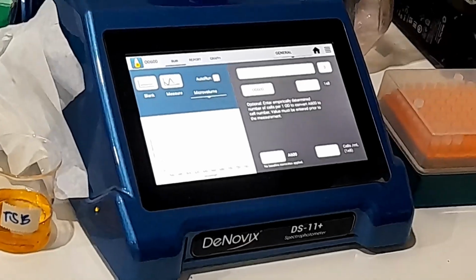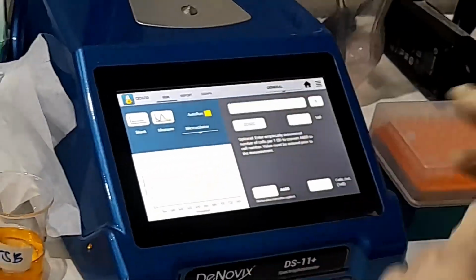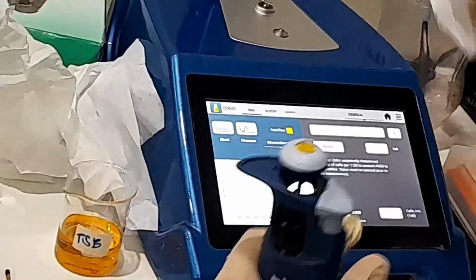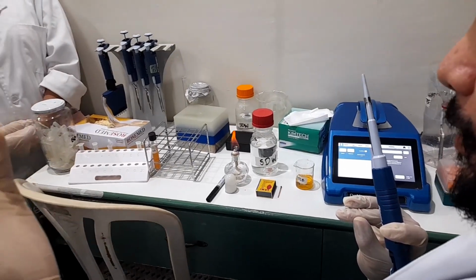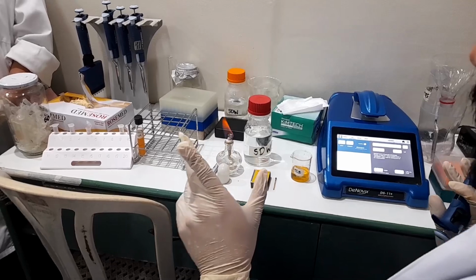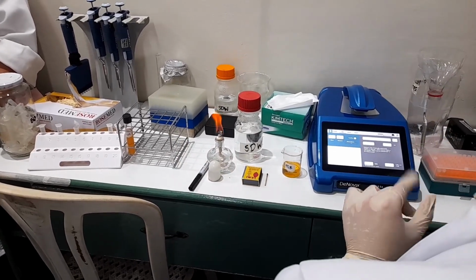I'll have to take that out somewhere. Okay. Times 10 to the 9? Okay. So, when I was telling you earlier that we need a certain amount of cells for it to work, it's not actually one number, it's a range of cells.